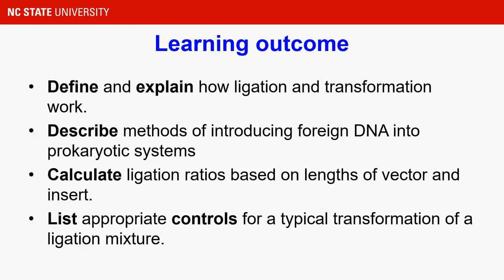In summary, we hope following this lecture, you are able to define and explain how ligation and transformation work. You can describe methods of introducing foreign DNA into prokaryote systems. You can calculate ligation ratios based on length of vector and insert. You can list appropriate controls for a typical transformation of a ligation mixture.